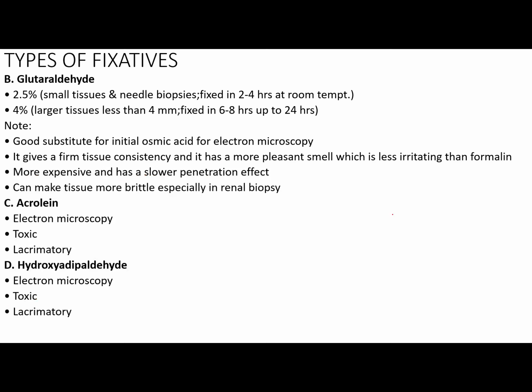The second one under aldehyde group is your glutaraldehyde. Now, glutaraldehyde could be divided into two concentrations: 2.5% glutaraldehyde and 4% glutaraldehyde. Kapag 2.5% glutaraldehyde, this is used for small tissue and needle biopsies. You have to fix it for 2 to 4 hours at room temp.